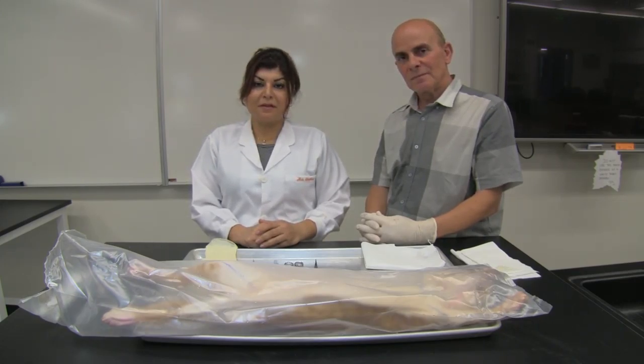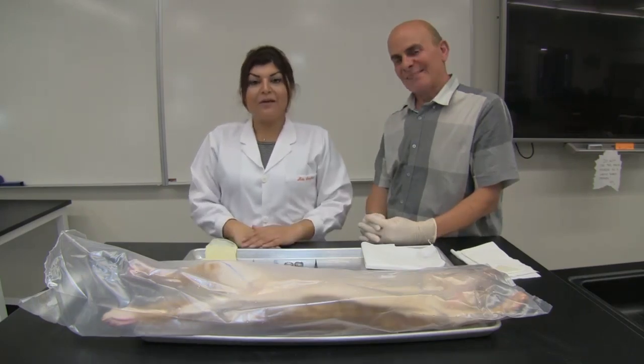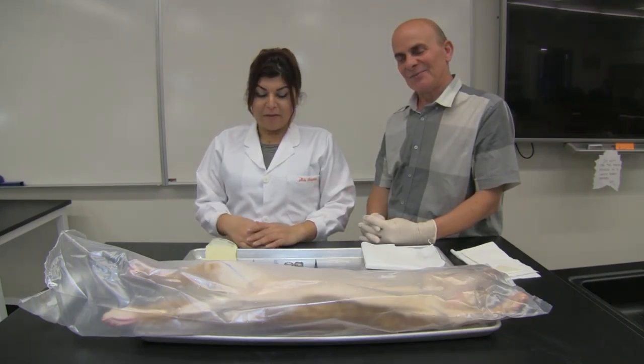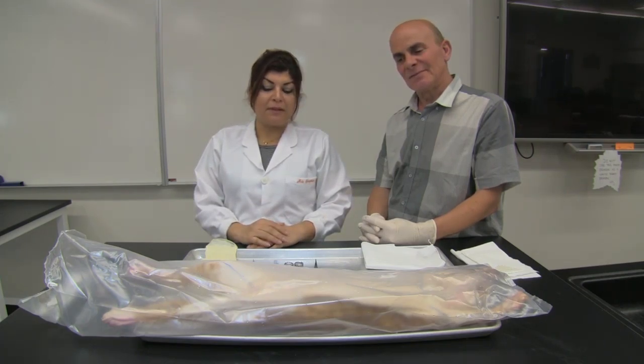I'm Dr. Neda Sadeghiani with Dr. Sayed Ahmad Panah. In this session, we show the equipment and the tools you need for working with the cat, skinning the cat, and neck muscles. The equipment that you need is your lab coat. You can use goggles and a mask if you need.